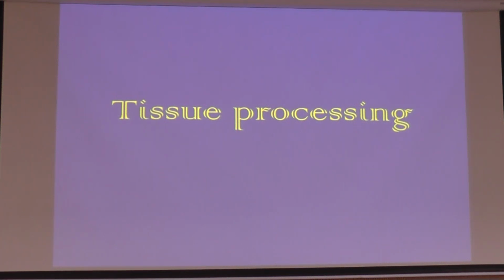So good afternoon all. This is on tissue processing, like how we are receiving the gross specimen and how we are preparing the slide. So basically today the class is on tissue processing.